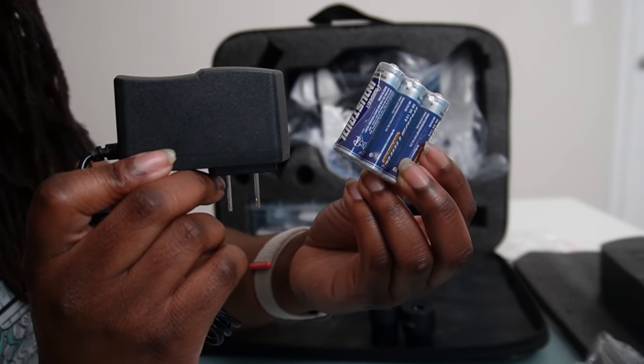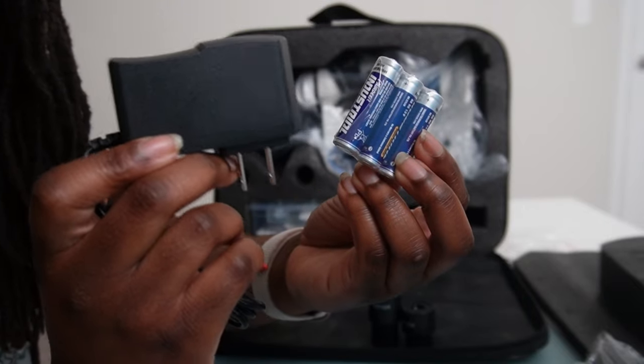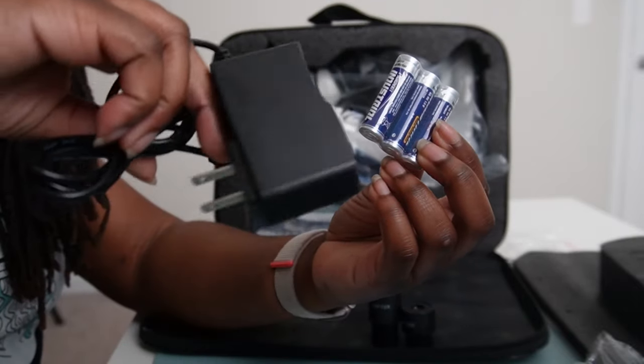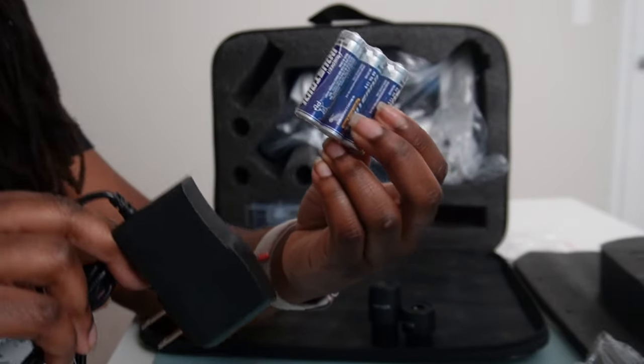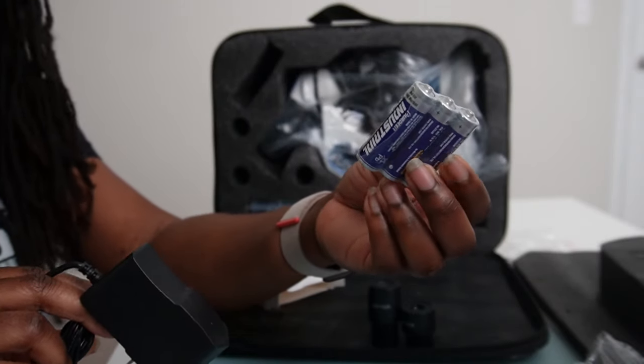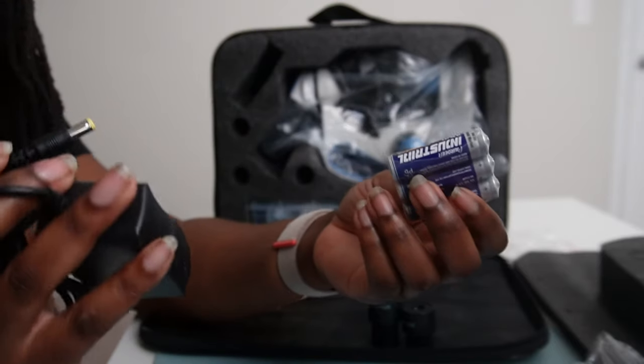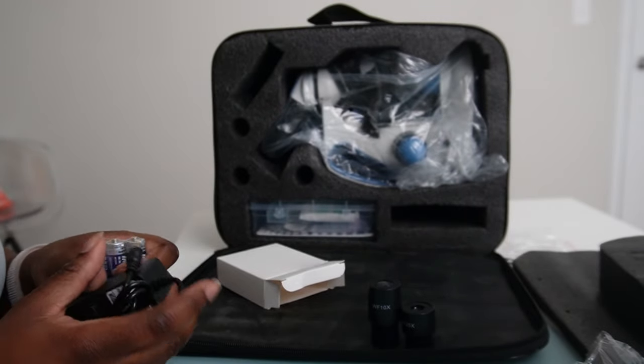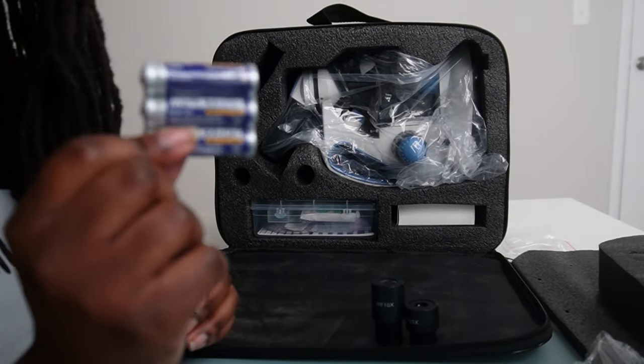It comes with a cord if you want to plug it in, and it can also take batteries. This is great if you're on the go. You can pretty much use this microscope anywhere that you would have a level surface, and I'm going to test with the batteries today.